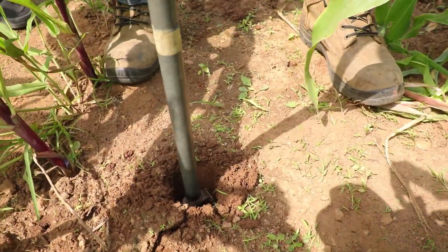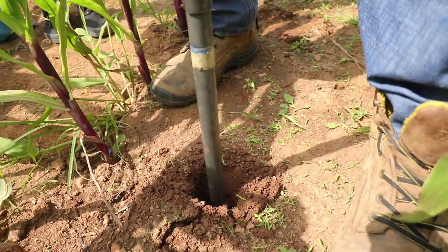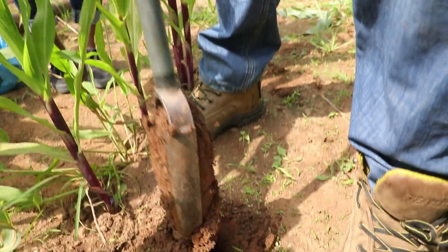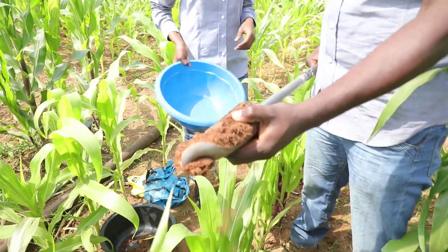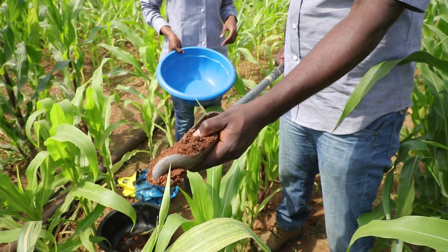Some soil from the surface can fall into the hole while collecting the topsoil sample. To make sure that it does not get mixed into the subsoil sample, make sure that the upper third part of the soil in the auger is removed and discarded.